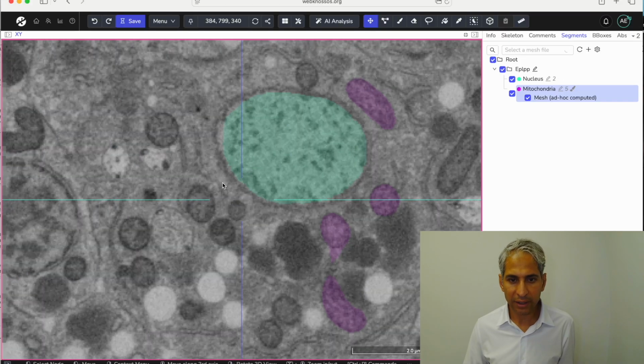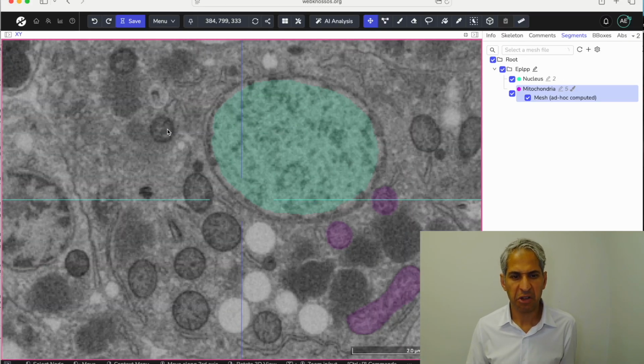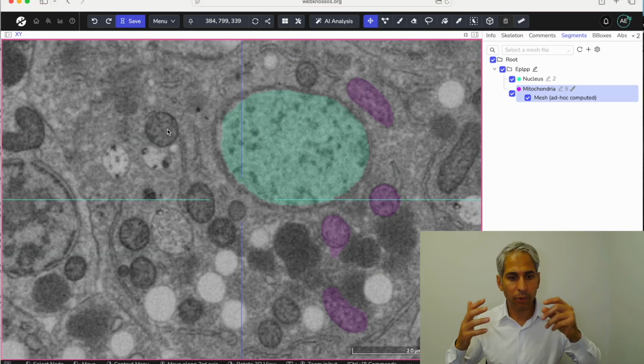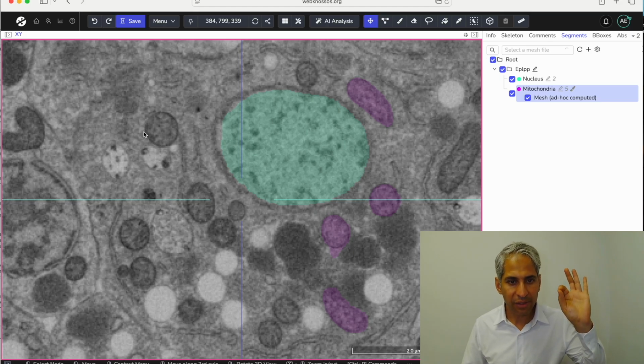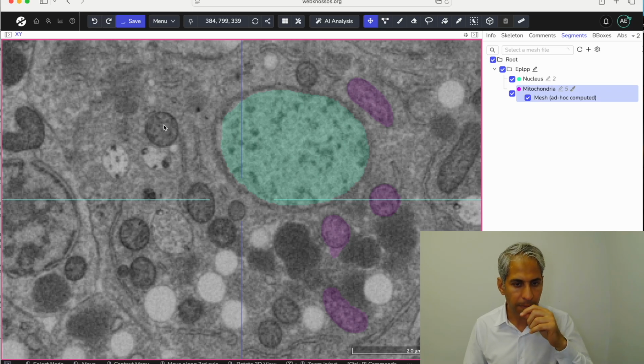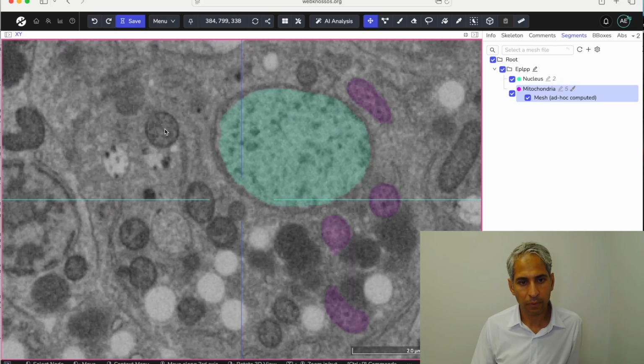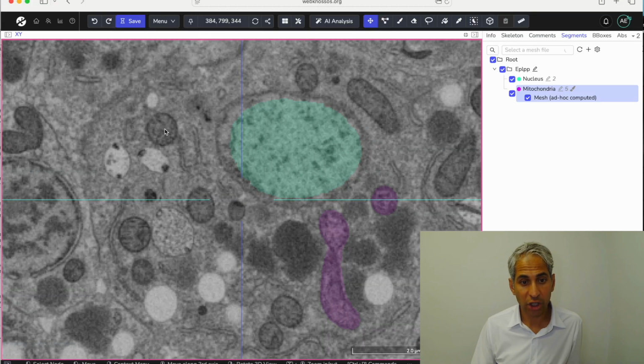I think when I first looked at this cell, I was like, is this a mitochondria? No, this doesn't look like a mitochondria. It's spherical. But based on what I've calibrated myself with so far, it has that thick membrane of the same kind of tone of dark gray, and it has things on the inside. It's not smooth and clear like this one. So I'm going to go out on a limb and say I am 85% confident this is a spherical mitochondria. Remember, mitochondria are dynamic in shape, location, and number.